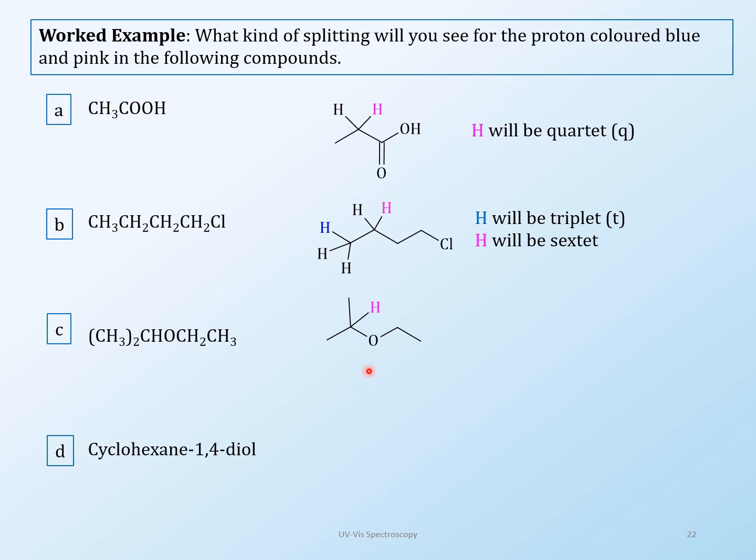So now in this case, this one is an isopropyl group here, right? So this isopropyl, oh, we just did this one, sort of. So anyhow, this proton is looking at the 6 plus 1, septet. That's how it would be.